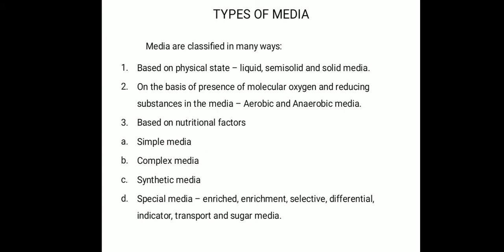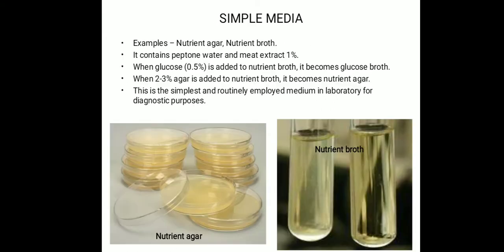Okay, the first media we are going to discuss is the simple media. These are the media which are routinely used in the lab for diagnostic purposes. Examples are nutrient agar and nutrient broth.